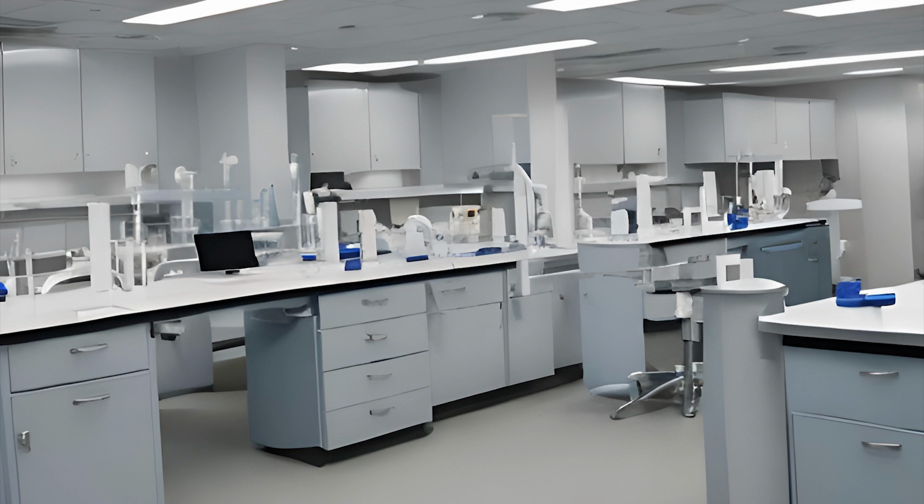Storage after testing is typically considered part of your post-analytical phase because you're done testing the sample, you put it in storage. However, it has the potential to become part of the pre-analytical phase again if the physician calls back down to the lab and says, hey, I saw these results. I would like to order another test. Do you still have that tube there, or do I need to send the patient back? If you've still got the tube in storage, that physician can then place another test order on that tube, and you pull it out of storage. So now storage has become part of the pre-analytical phase for this new test.